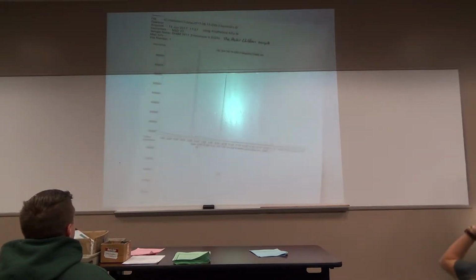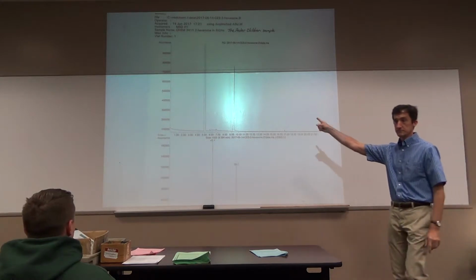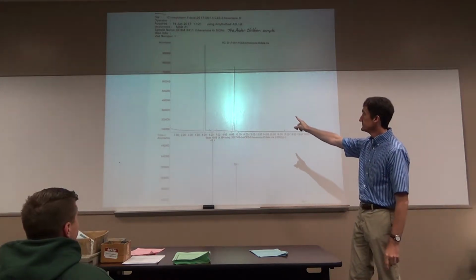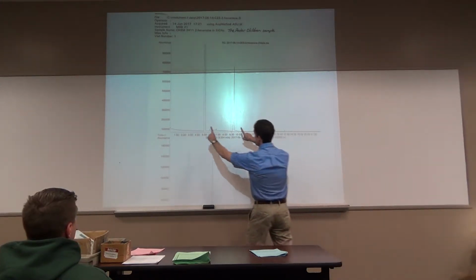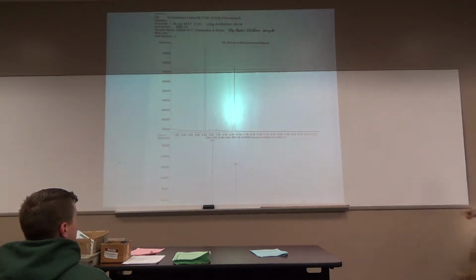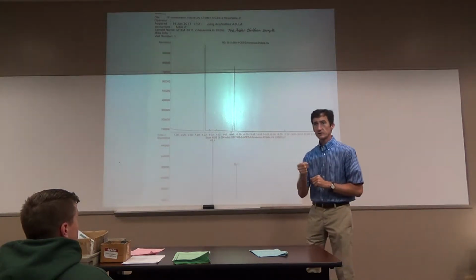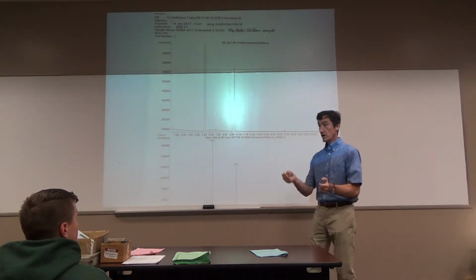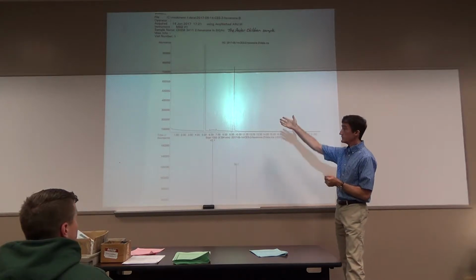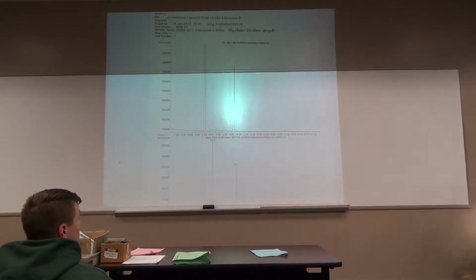Here's something very important. Is the compound pure? No. Two major components, some very minor components. But hold on, whenever you run a GC mass spec, you have to dissolve the compound in a solvent. Well, the solvent's there too. The solvent's going to give a peak. Well, guess what? One of those is solvent.